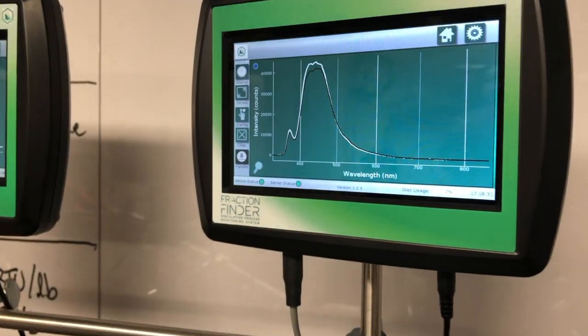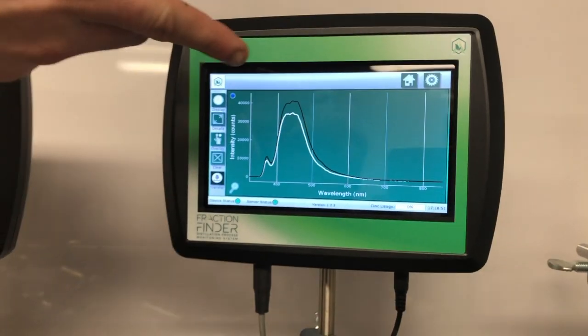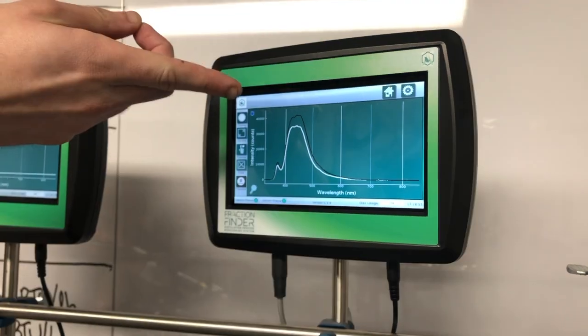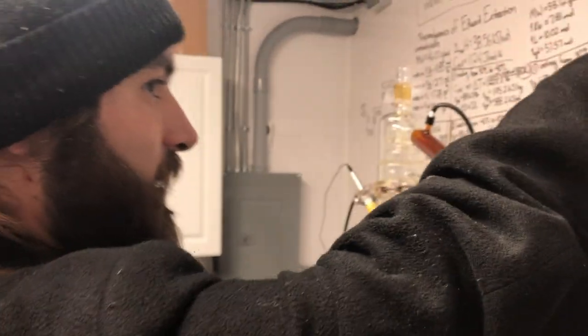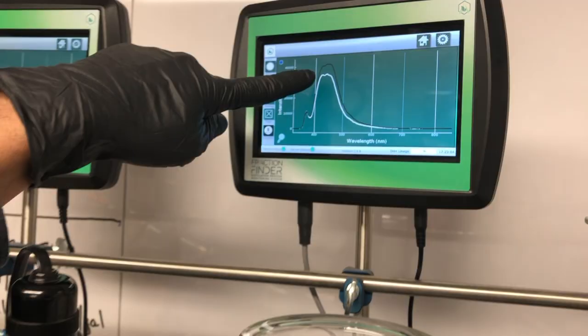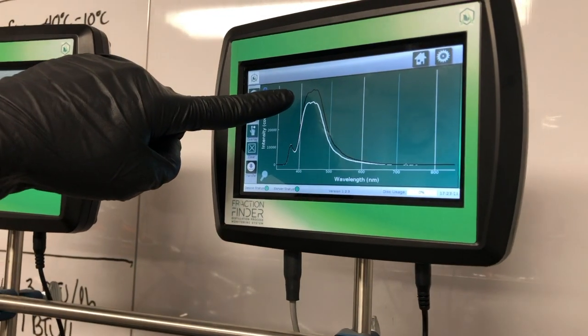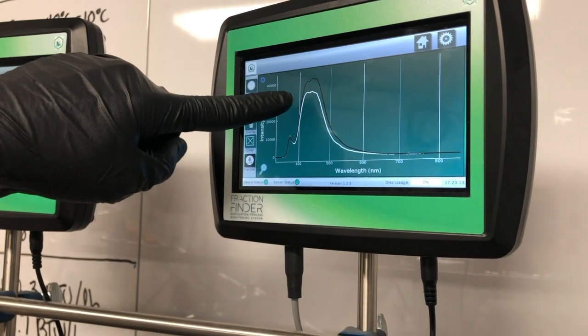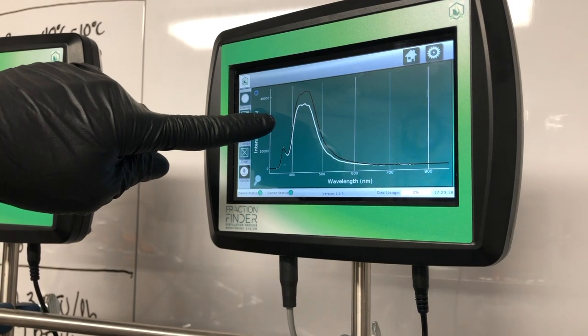So, yo, we dropped in, we're at least now getting more of the heady heads as opposed to the actual cannabinoids. Look, that 460 peak is not super high, and we're not talking about huge variations, but we're talking about changes of 4 degrees Celsius. We can see relative concentration changes in 4 degrees Celsius in line right now. Peak on the right is going to be our mains peak, and the peak all the way to the left is our heads peak. And this is the current. So we have significantly dropped the concentration of mains and significantly increased the ratio of heads.